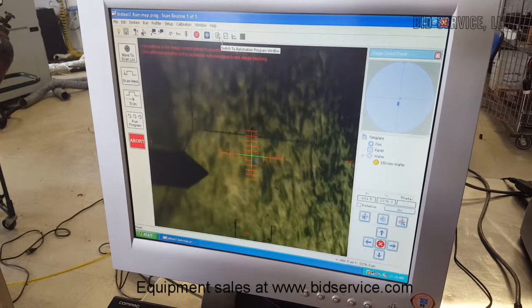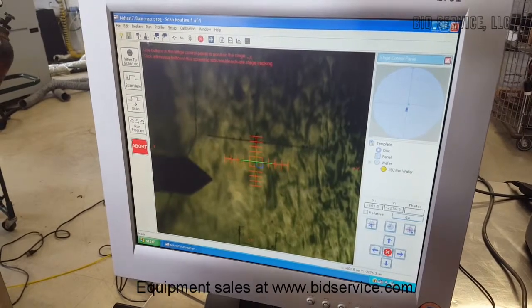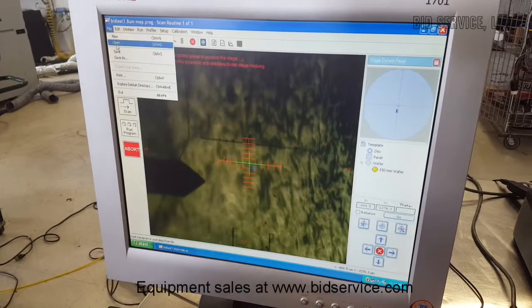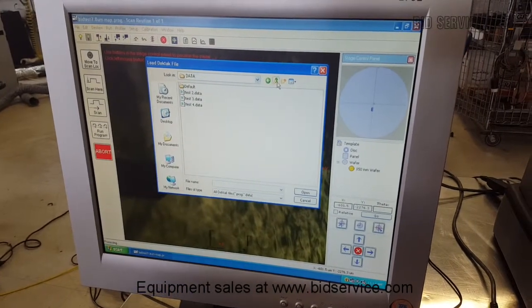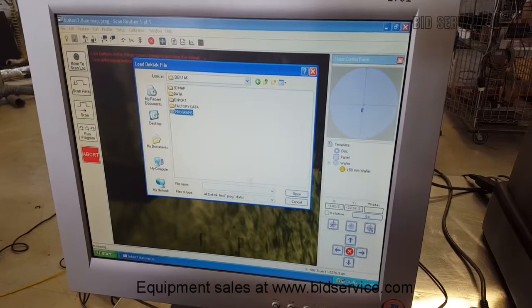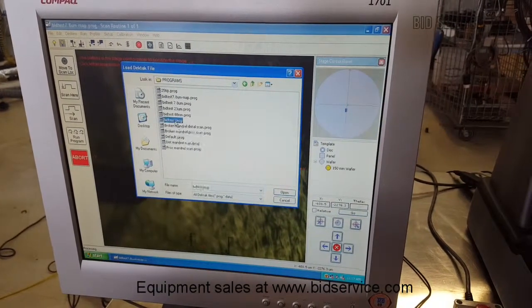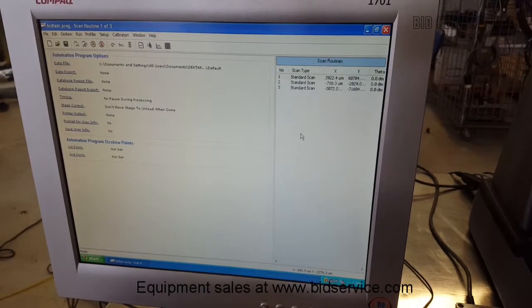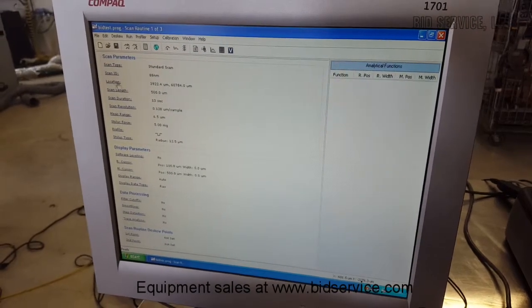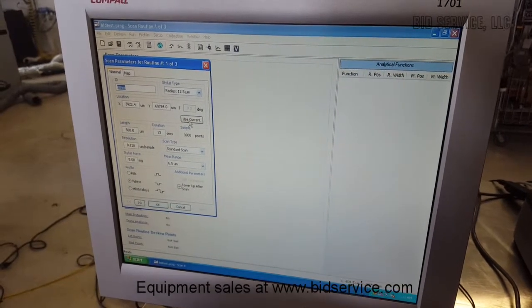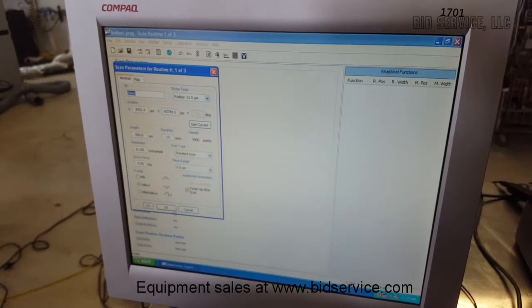This icon here is set up to use a scan automated program. I have a pre-programmed automation program. This would be after you set up all your locations — for example, after you position it, you can use the current location for each of your spots. Then you could do an automated run. So that's what we'll do now.